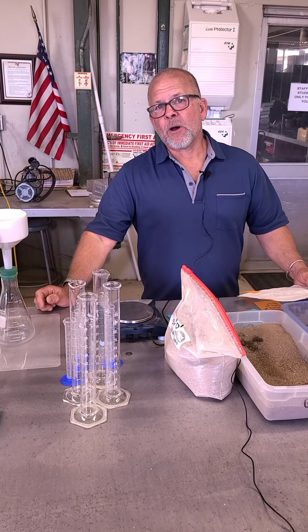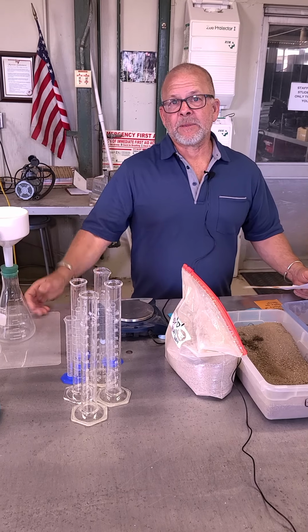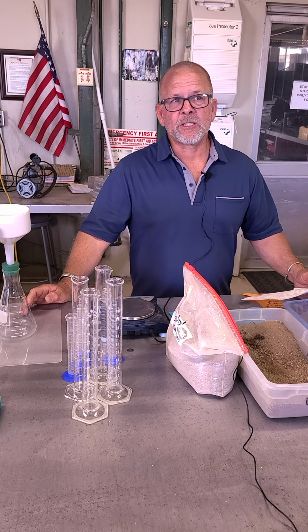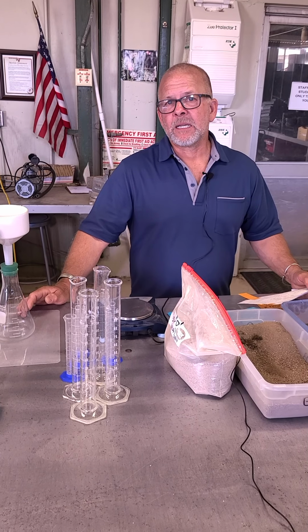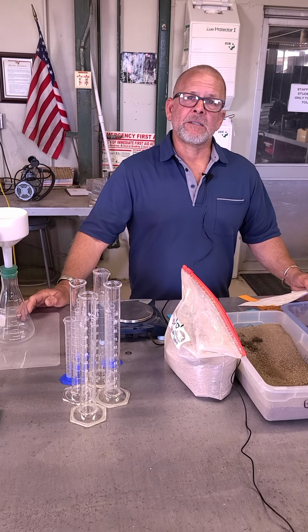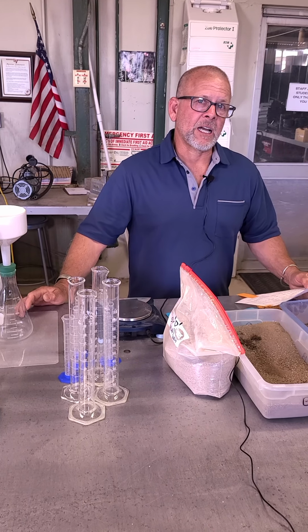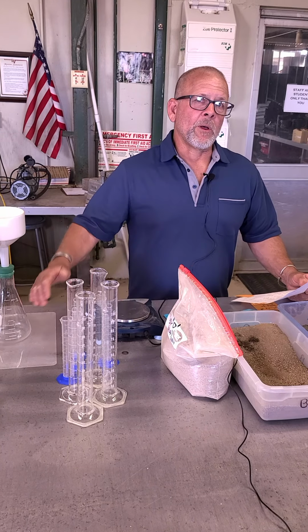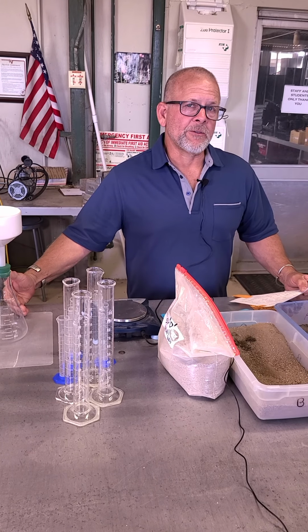As you know, we've been studying water movement in and through the soil in past lab exercises. We've also been studying the effects of salt on plant growth and development. So today we're going to look at how different concentrations of salt, and different kinds of salt, will react with water movement under different soil textures.